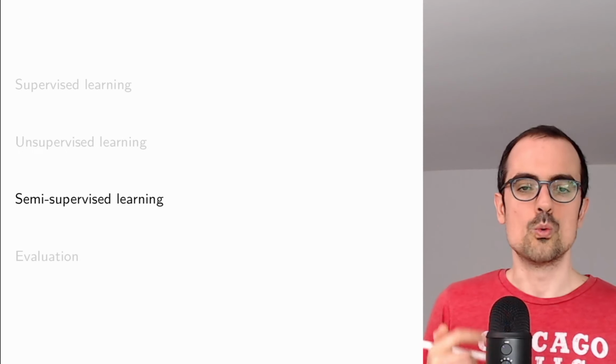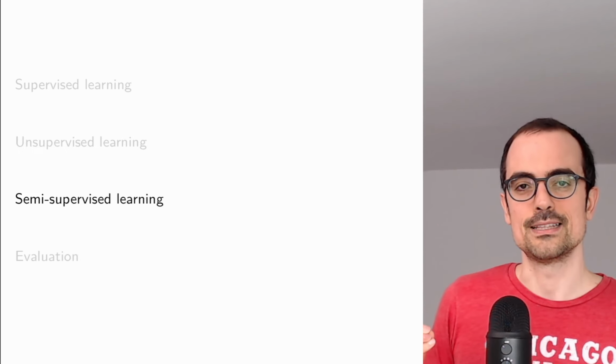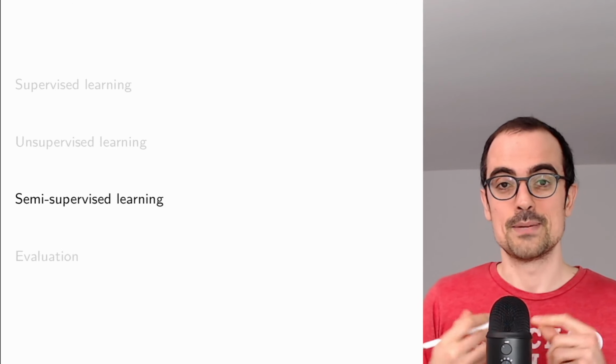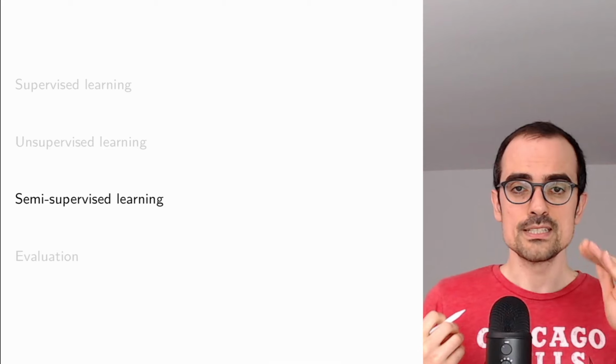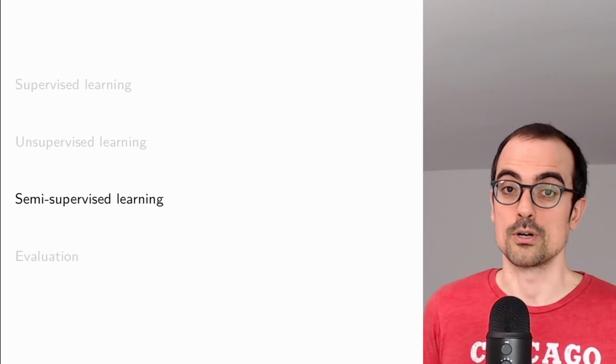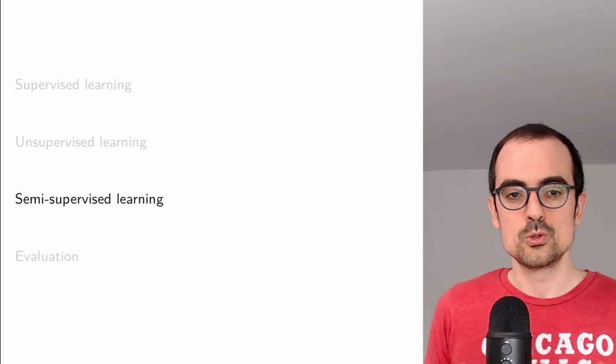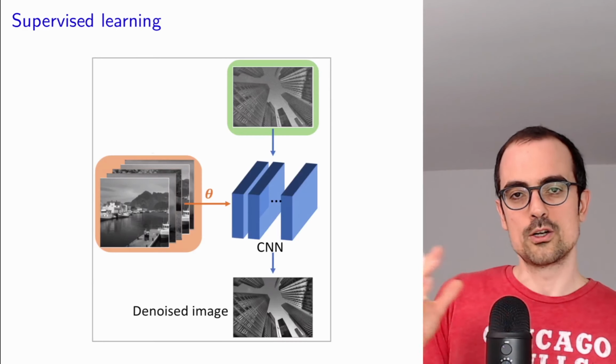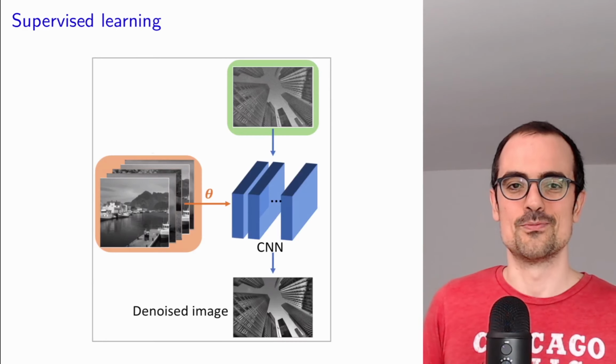Because of this issue where we realized that the unsupervised denoising method was actually working very well, but had this issue where sometimes the surface of the nanoparticle was not super clear, we were inspired to try out a semi-supervised learning framework where we try to combine the best of both worlds.